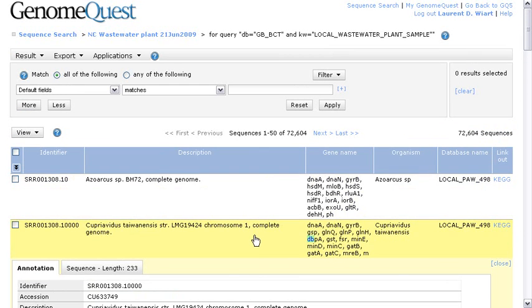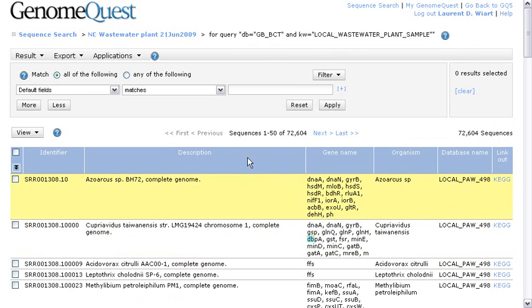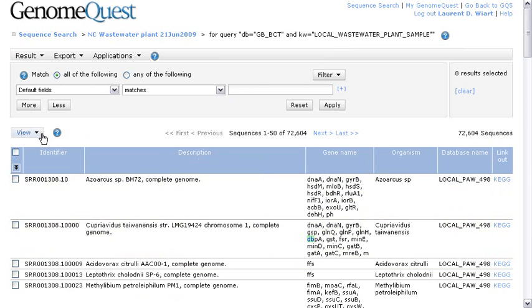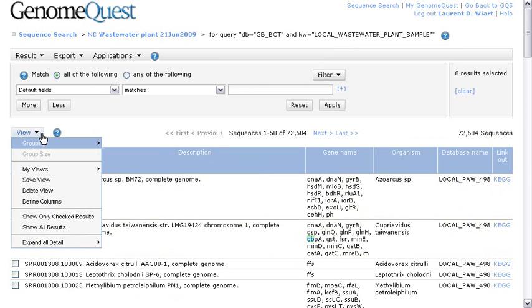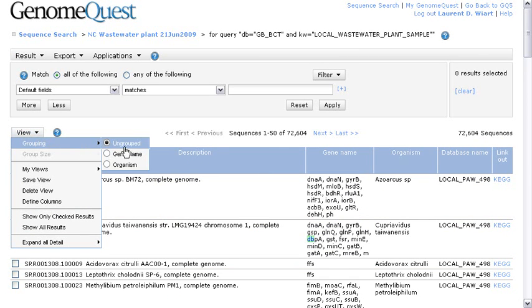Now on this page, you can do a lot. You can sort by column. You can also apply filters or change the view. So let's take an example, and group by organism because we want to see what is the split up by organism among GenBank bacteria.